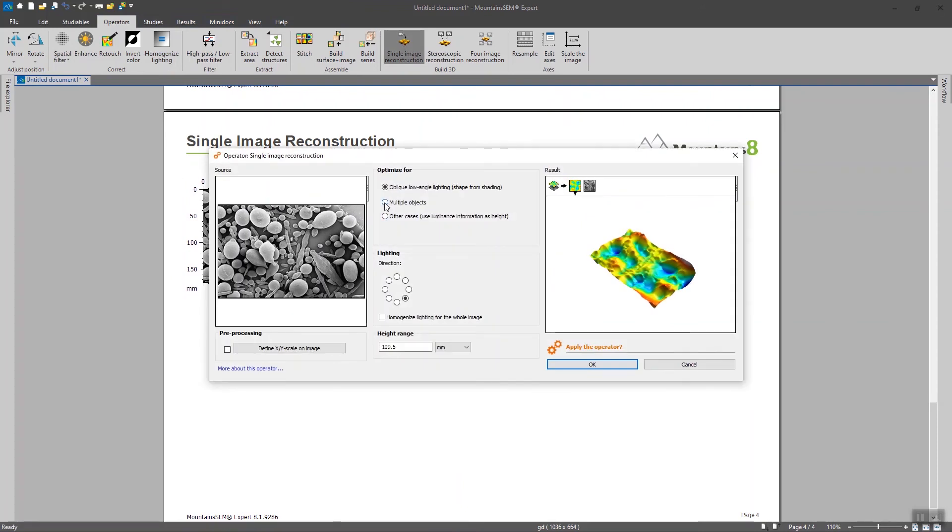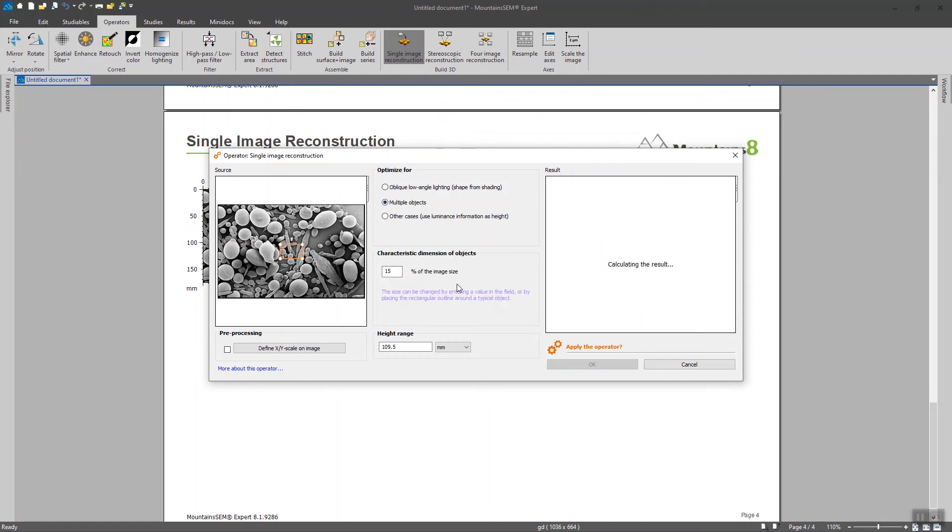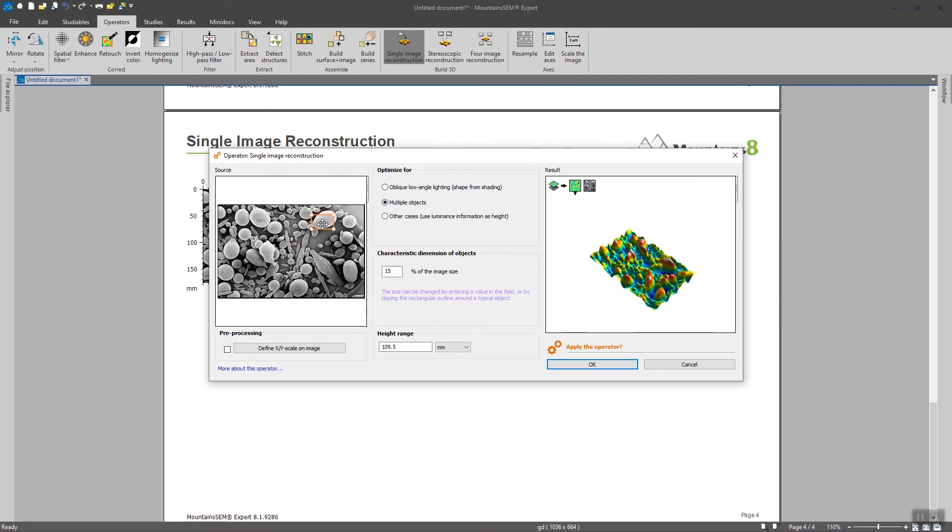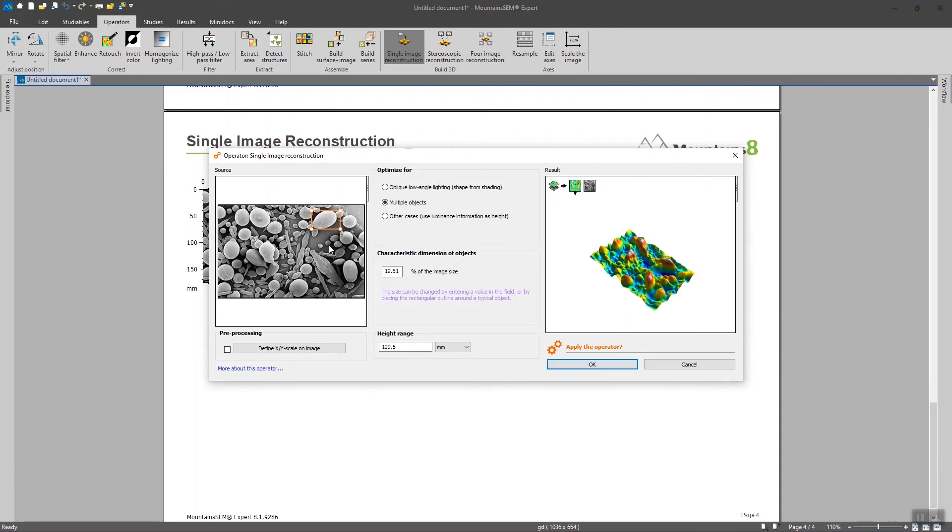And this time I'm going to tick multiple objects. And I'm going to define the size of one object on the image. And basically the software is going to, from this reference point, try to find the other elements on the image, the other objects, and to guess their size and volume also.